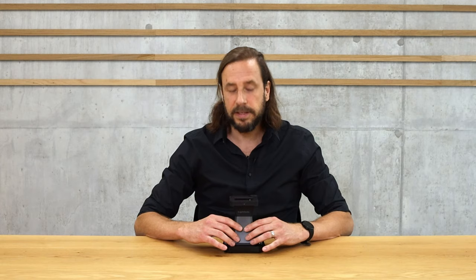One function is the measurement of the color of your roasted coffee, and the other is the particle size and particle size distribution of your ground coffee. When it comes to the color meter function, the device can measure the color of your ground coffee as well as the color of your whole beans.